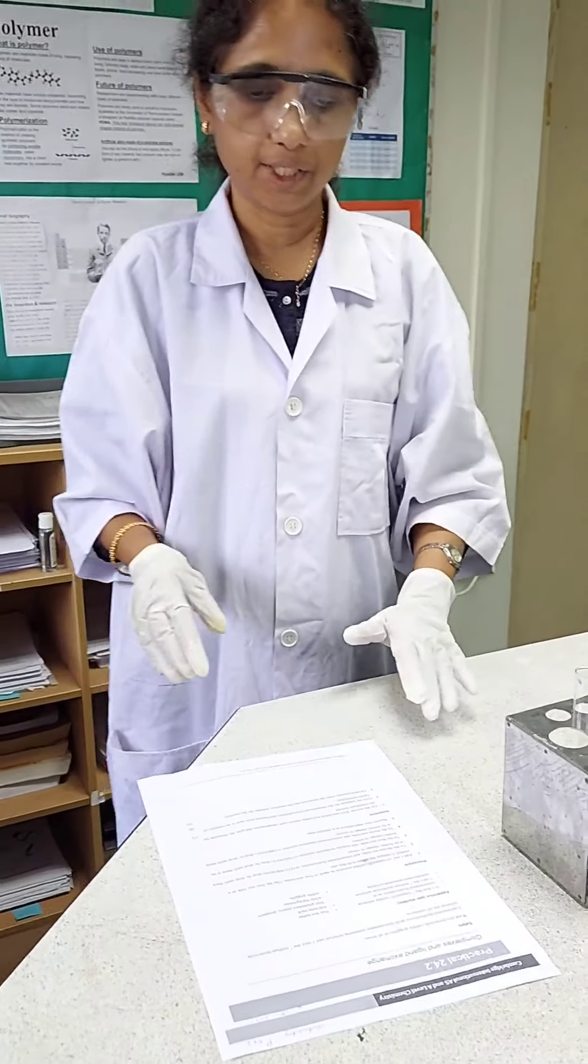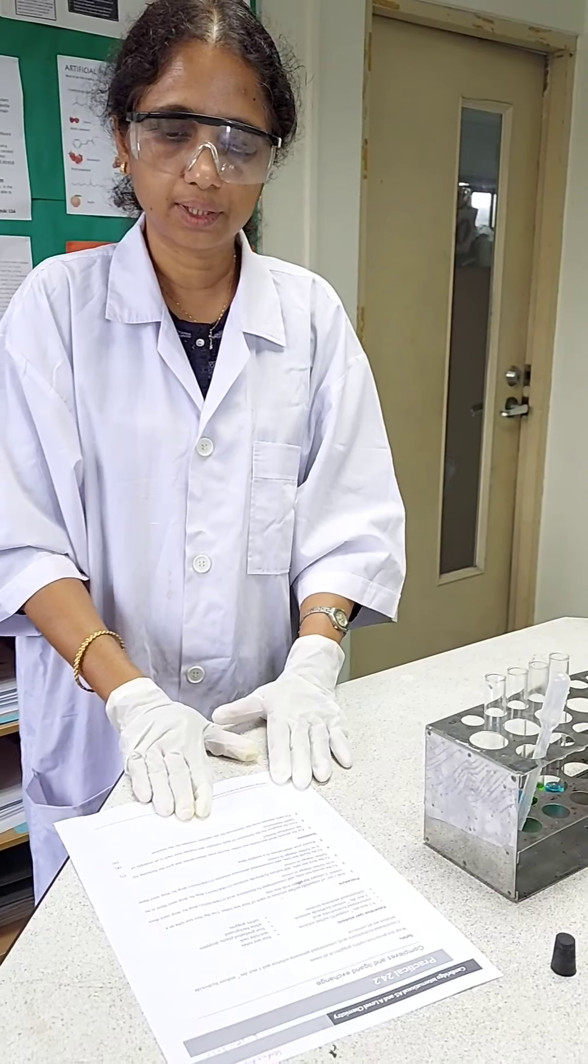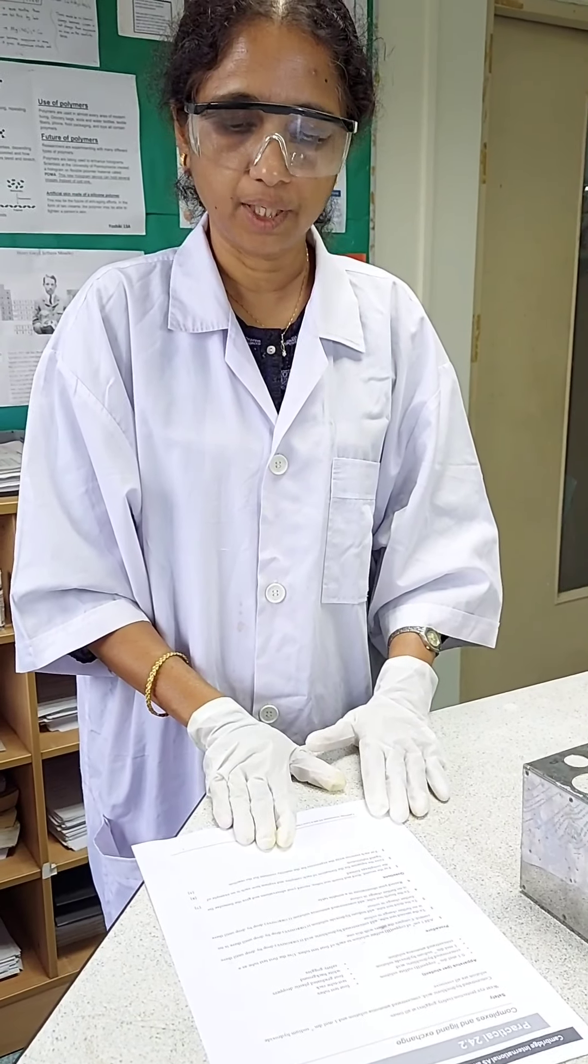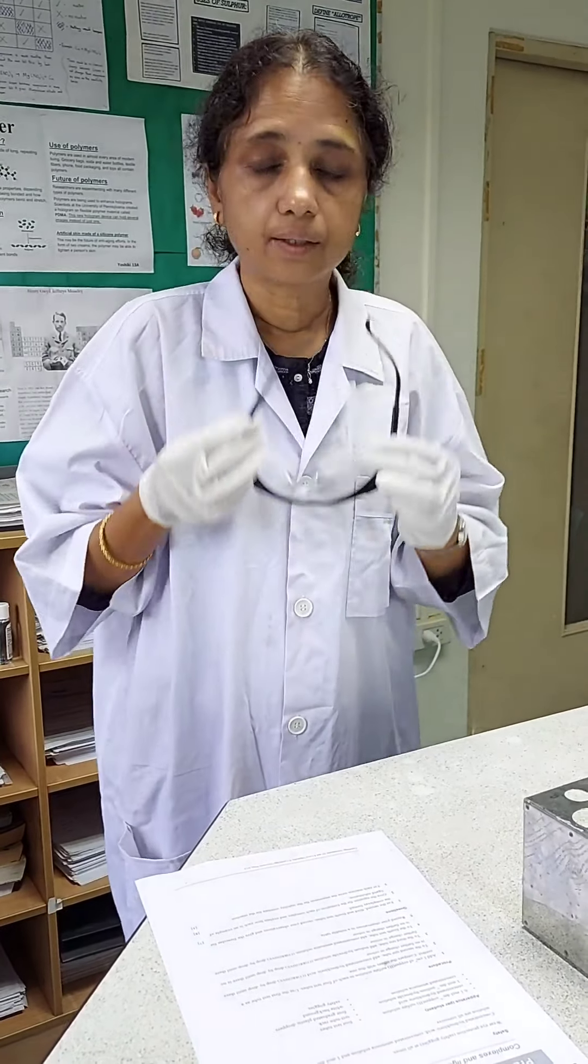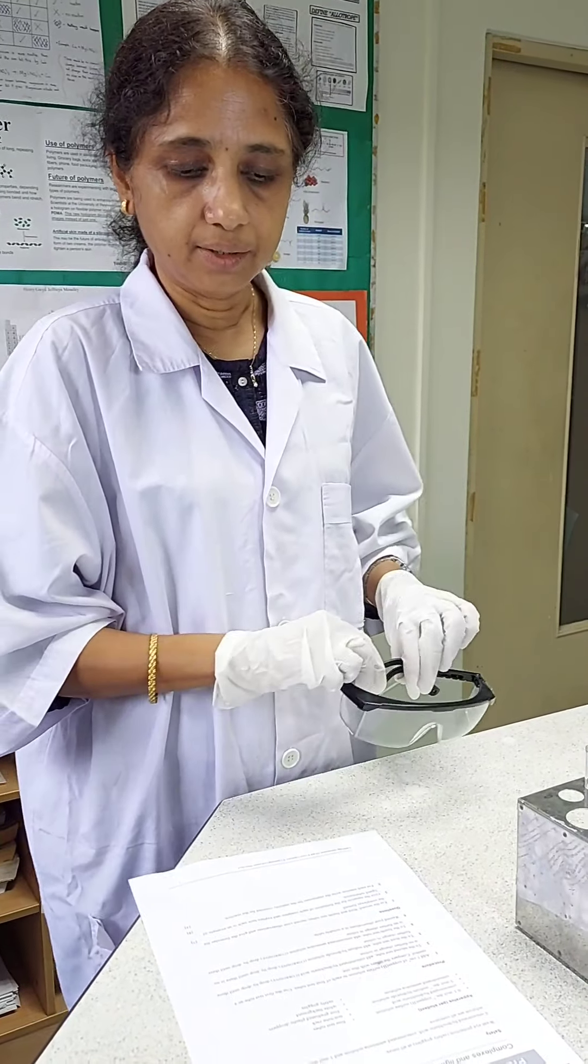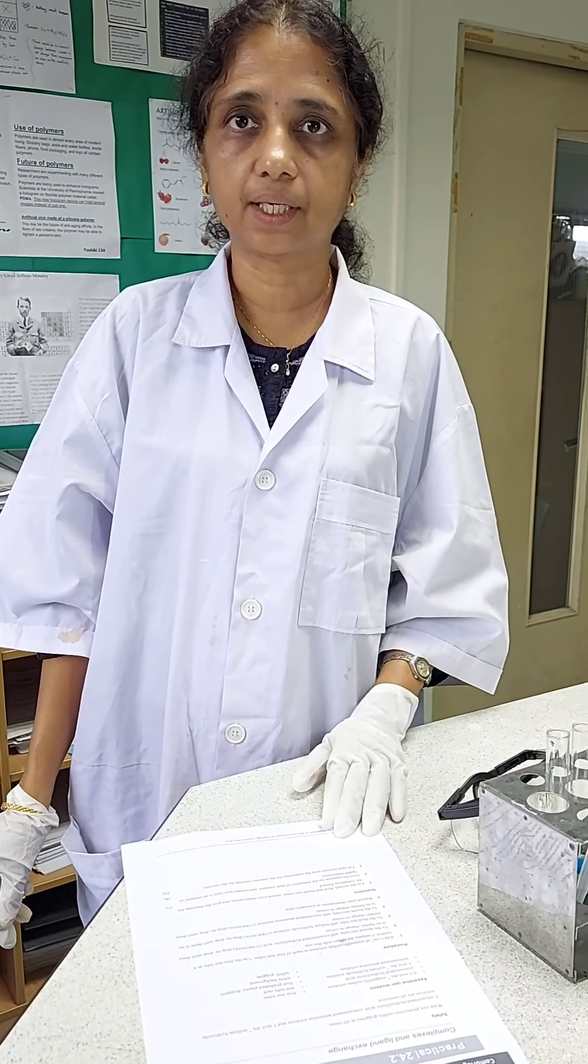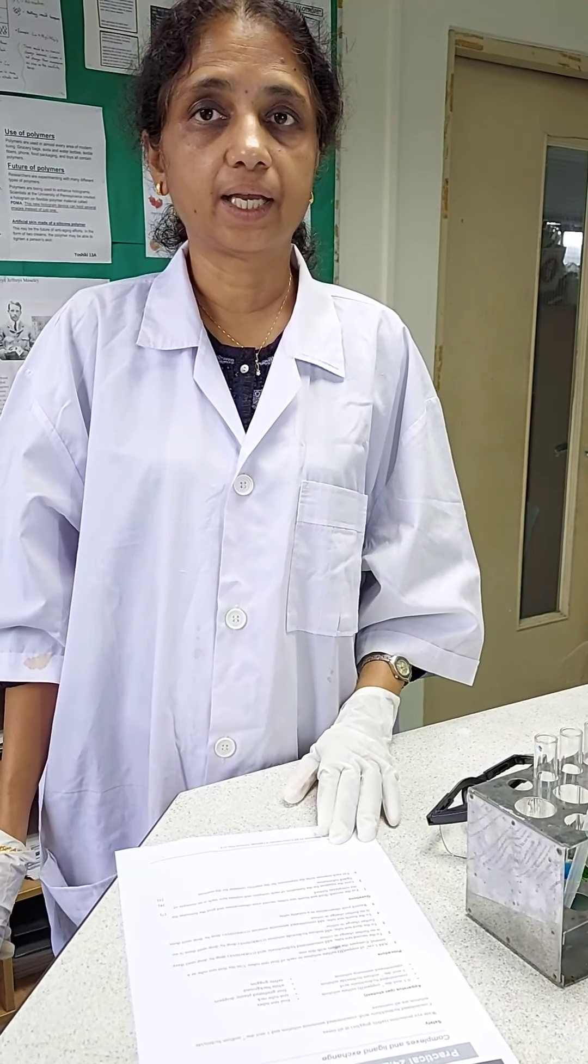Now to the questions. For the second, third and fourth test tubes, record your observations and give the formulae for the complexes formed. Second question, give the equation for the formation of each complex and explain how each is an example of ligand substitution.